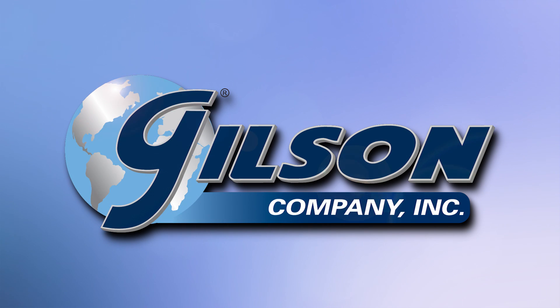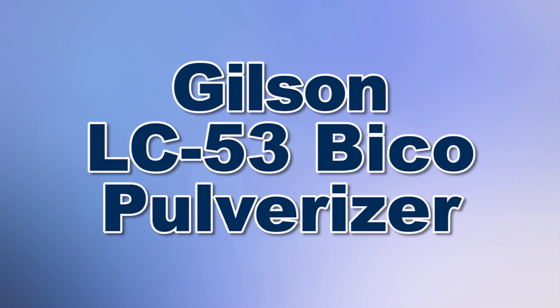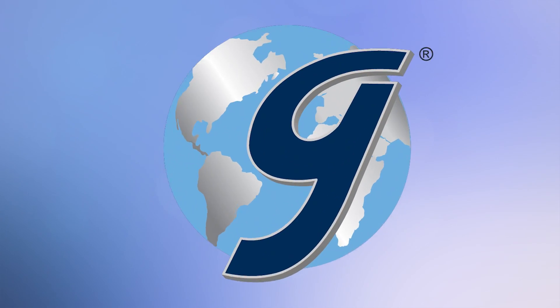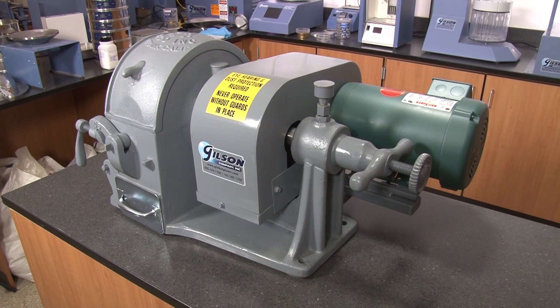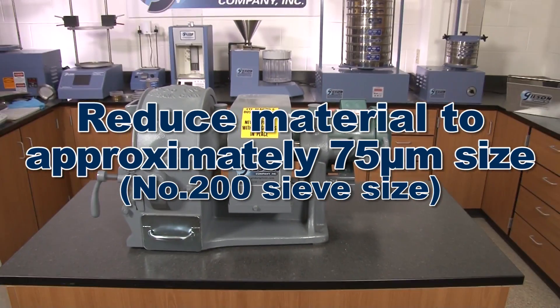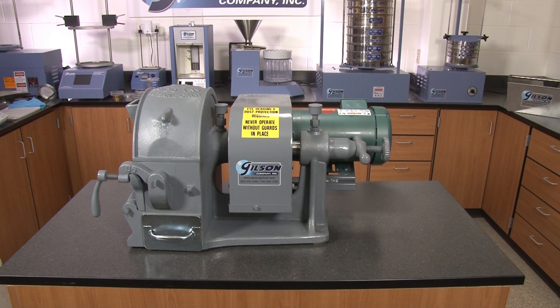When you need to reduce hard friable material into finer particle sizes, then Gilson is your best choice. The Gilson LC53 Bico Pulverizer features a time-proven grinding design for fast and efficient processing of quarter-inch feed material, including hard rock and ores, into approximately 75 micron size — all within a single pass.